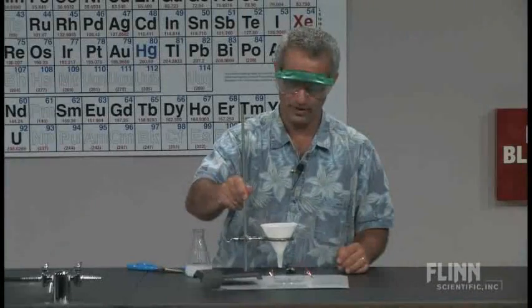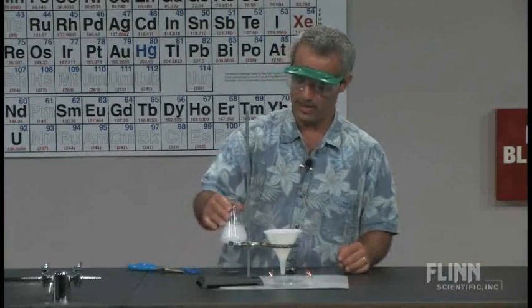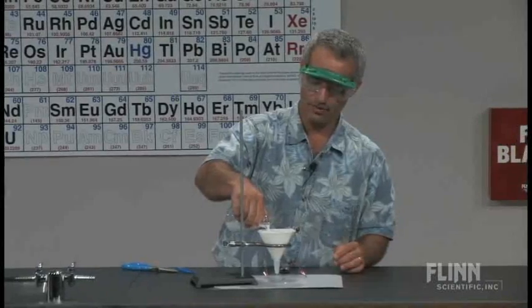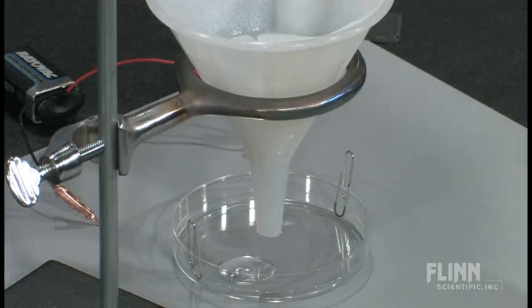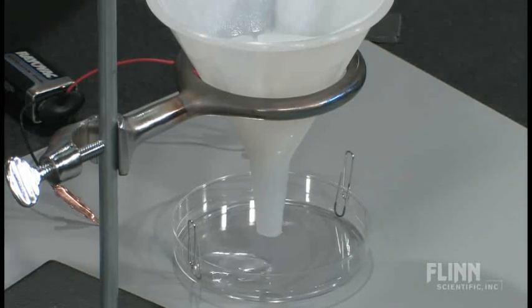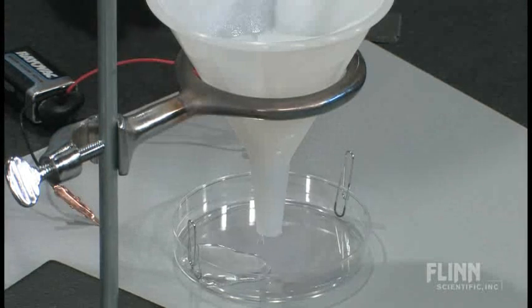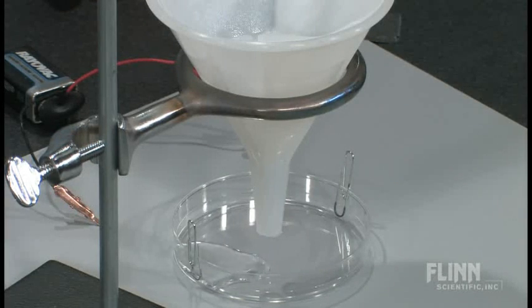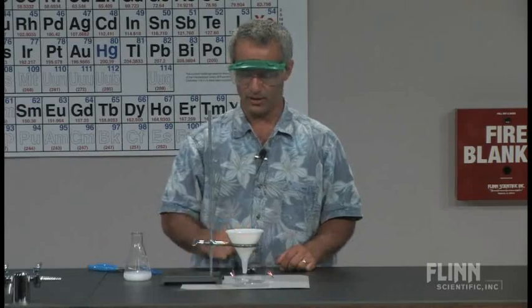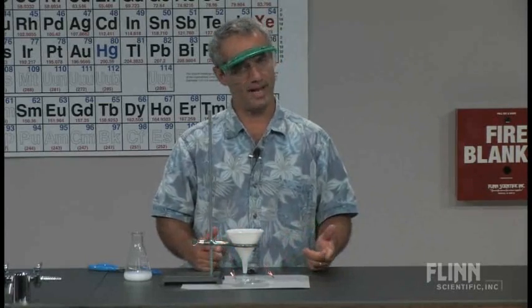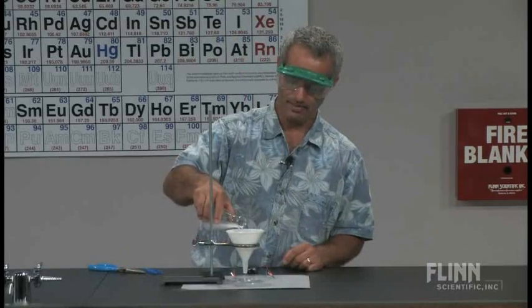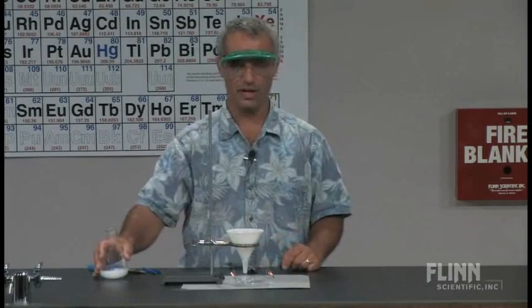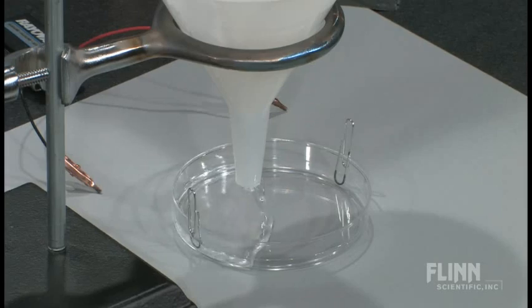We'll go ahead and filter into this here, and this will take a little while. If the filtrate comes through cloudy, literally just run it through again. What happens is the little tiny precipitate particles block some of the pores in the paper, and then you filter a second time and it comes through much clearer. Pour a little bit more in to get a little bit more pressure, but you want a clear solution for this to get the full effect.